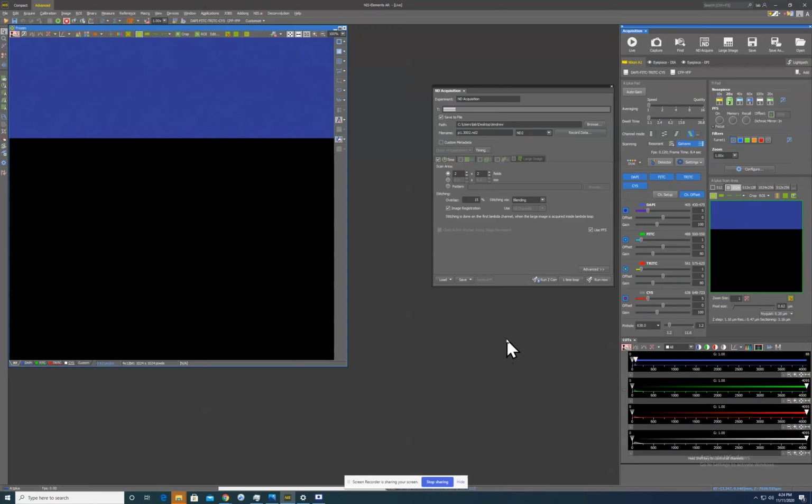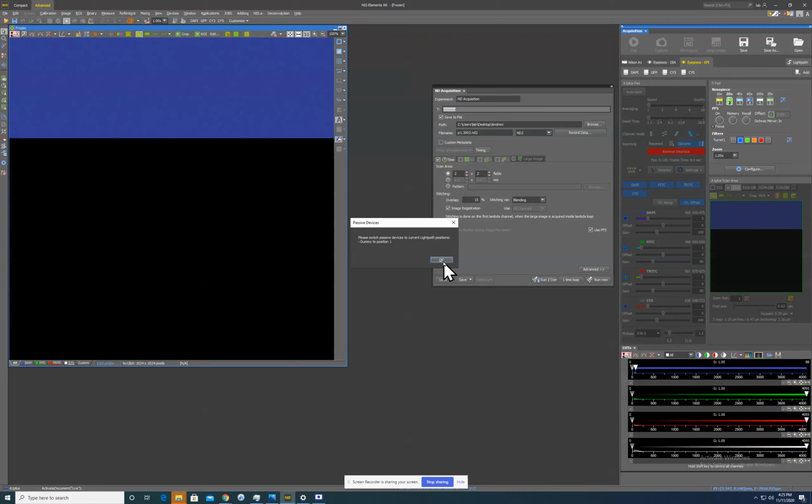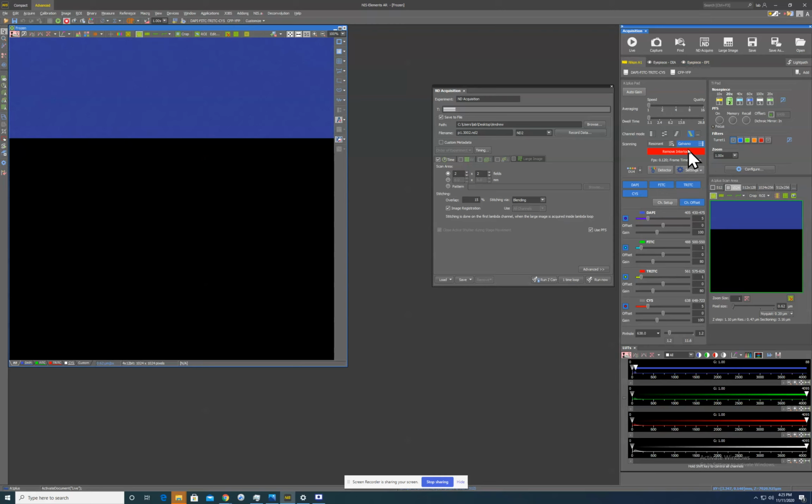I'm anticipating the biggest thing is going to be adjusting to your laser being on the top and your HV being on the bottom, and also having to come to the eyepiece tab, and then instead of disengaging it via a button, you have to come back over to the Nikon A1 tab and then manually remove the interlock. Other than that, everything is pretty much just the same.